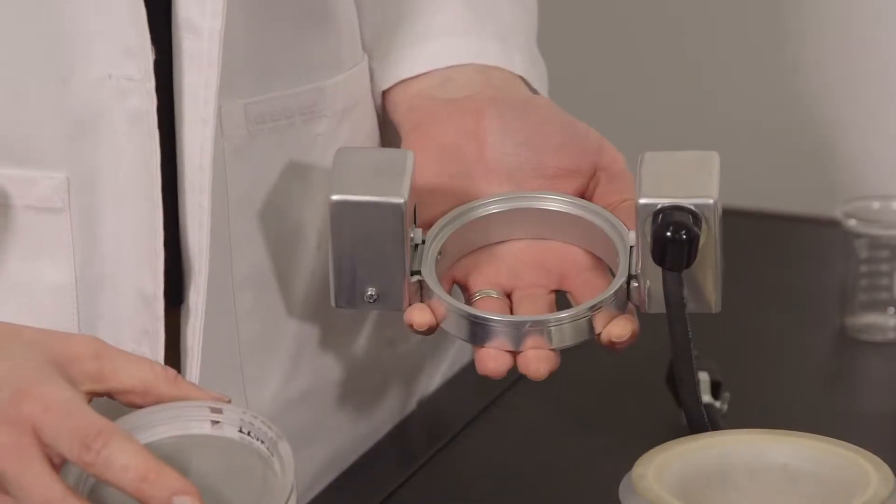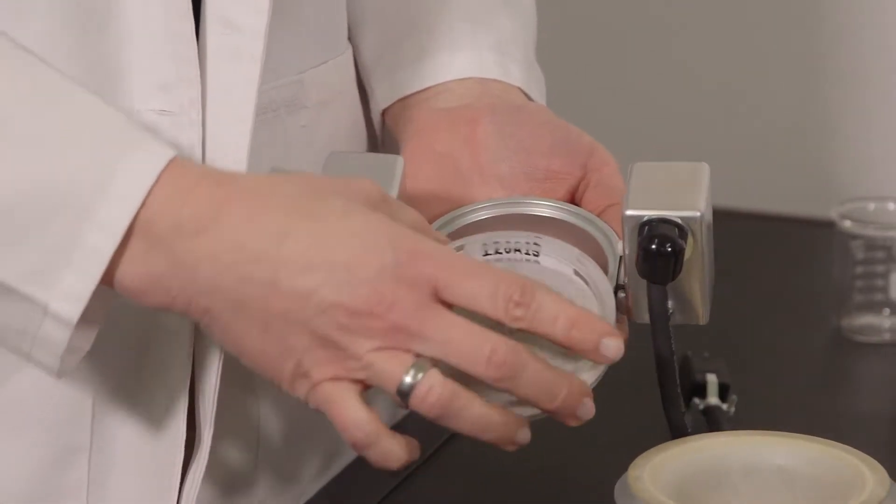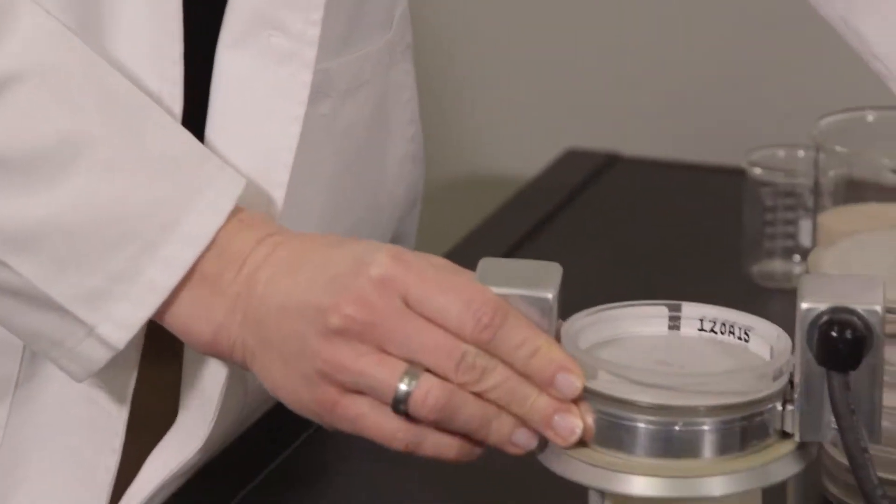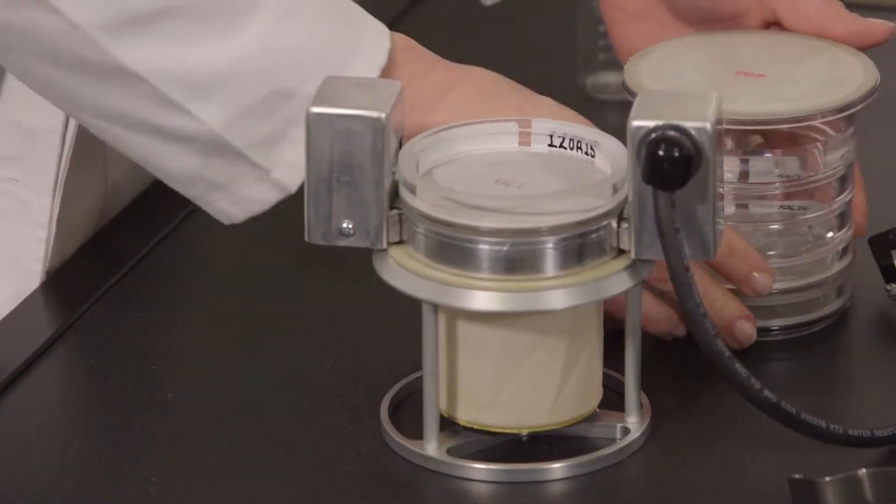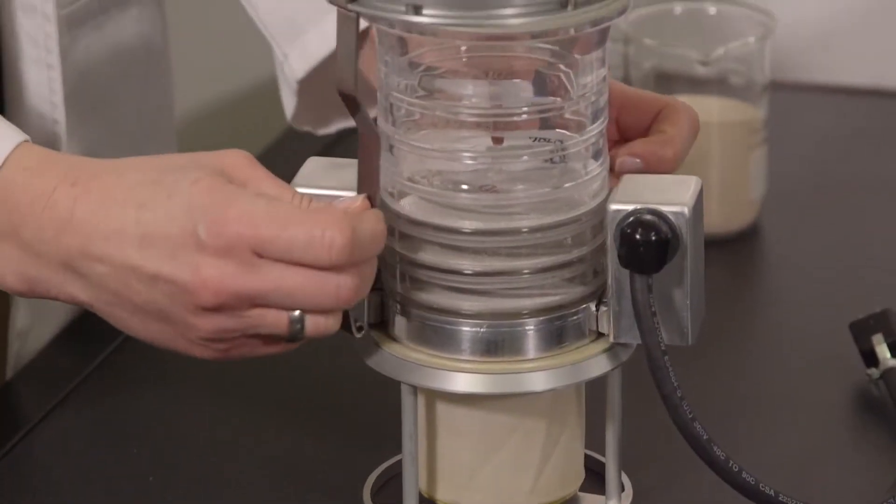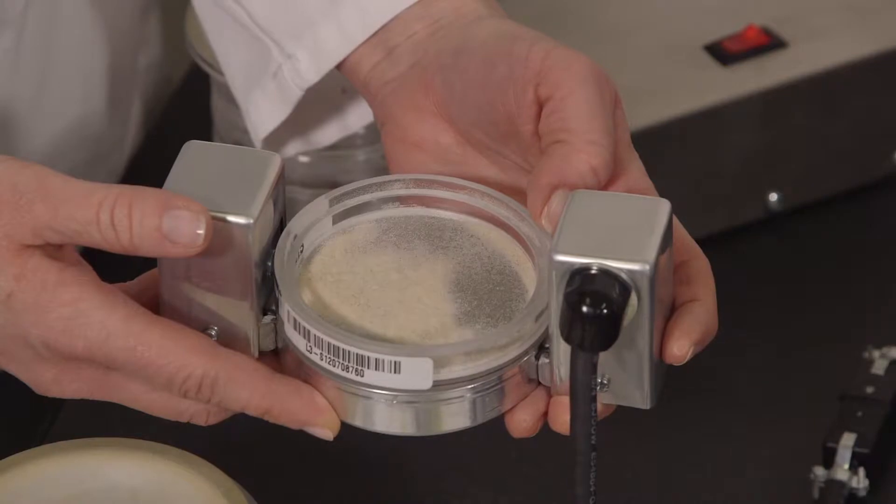Drop the fines collector into the holder and lock into place. Assemble the sieve stack with the finest sieve on the bottom, arranging coarser toward the top.